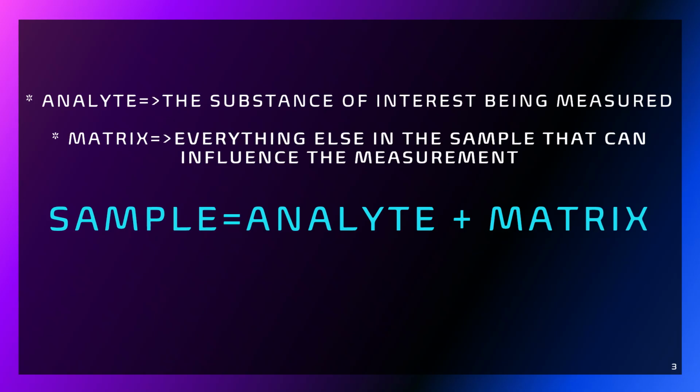Traditionally, whatever lab samples you have been given, you are almost sure that only distilled water and the analyte of interest are there. And the matrix is quite simple, that is usually distilled water. But here we are teaching you to determine the concentration of your analyte when the matrix is complex.